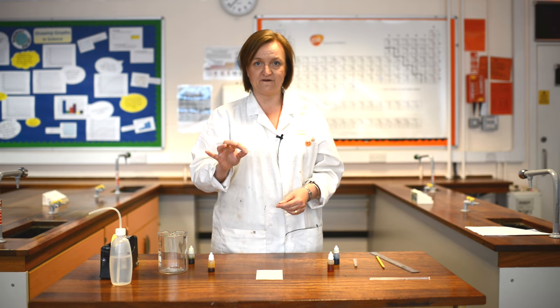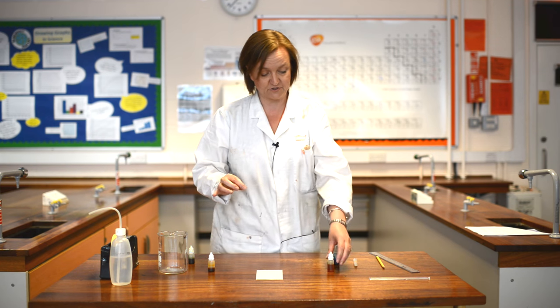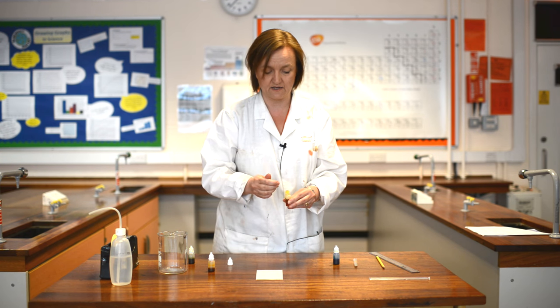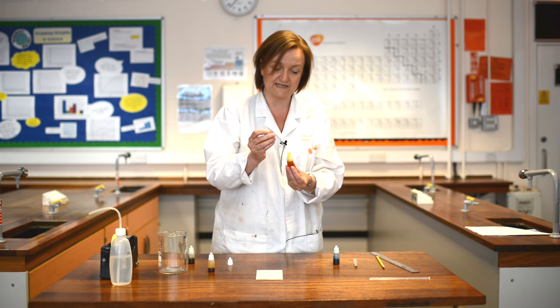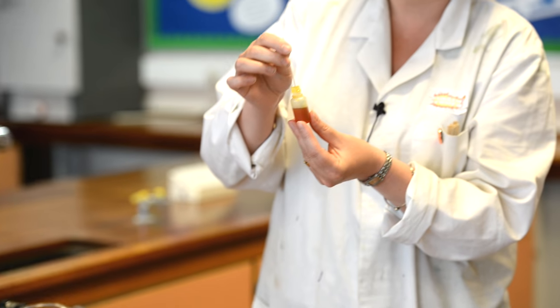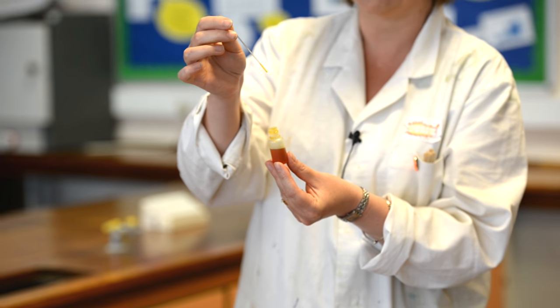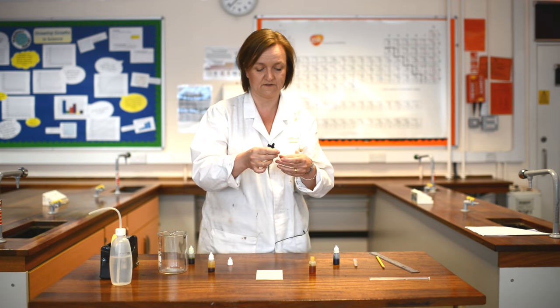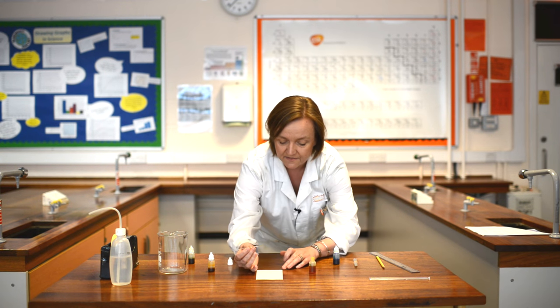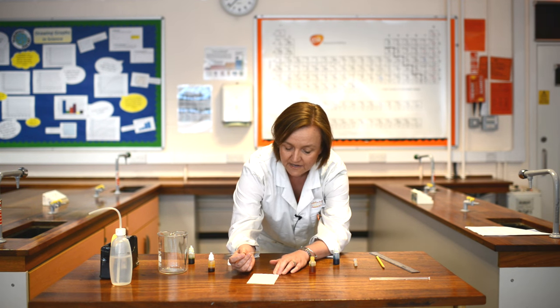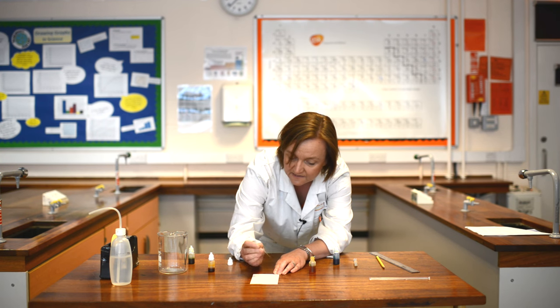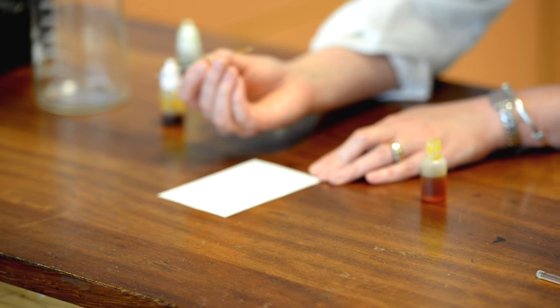I'm going to take a very fine glass tube called a capillary tube, and when I place this into the coloring it will automatically, just because of something called capillary action, suck a little bit of the liquid straight into the tube. So we don't need to use any kind of suction. To place it onto our cross, we just touch it very lightly and let it spread out on the paper.